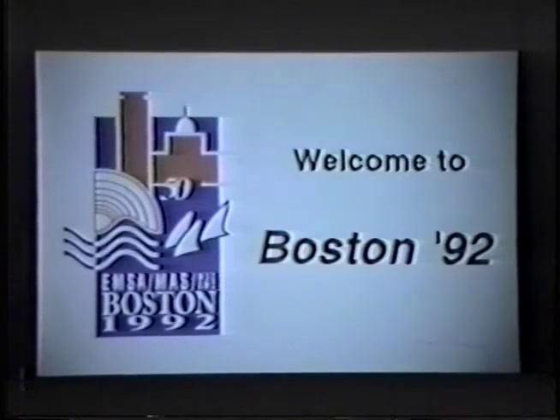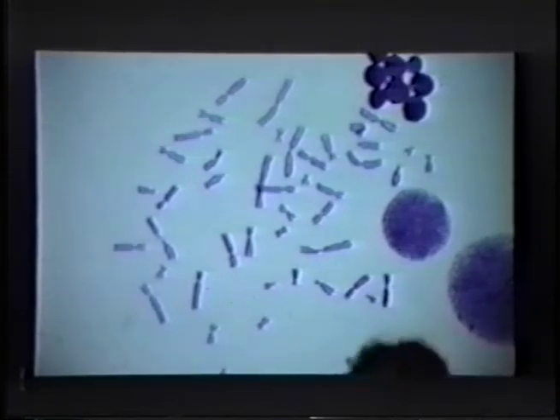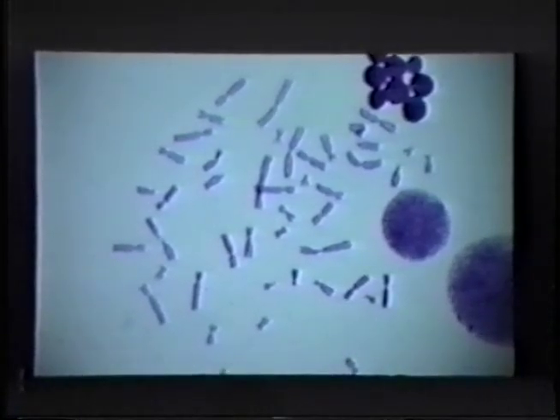Well, what I'm going to try to do is to first start by discussing some of the technology associated with molecular cytogenetics, specifically fluorescence in situ hybridization. This is basically a technology that allows you to look inside individual cells and chromosomes, and instead of seeing the somewhat featureless domain that you normally see in the light microscope, fluorescence in situ hybridization allows you to look with almost molecular precision at the organization of DNA sequences inside the interphase nuclei and in the mitotic chromosomes.